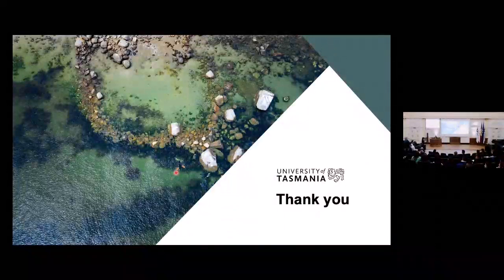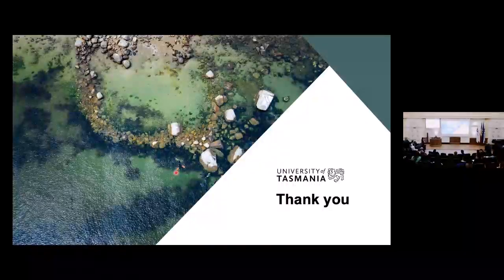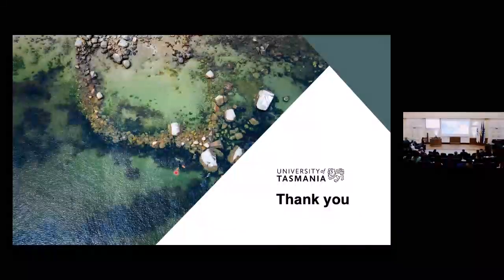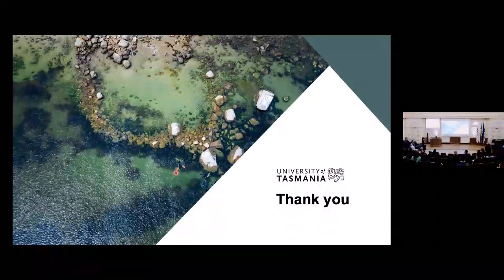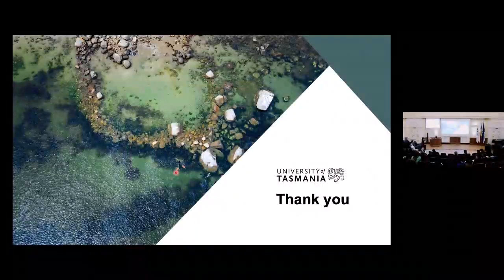Bacteria, just like humans, can change very easily. So if you feed them another medium, in terms of the volatile profiles, it will be quite different. For example, if I were to feed them spaghetti, the volatile profiles will be quite different from what I'm seeing in milk. So at the end of the day, we will need to put in a lot of work in terms of doing the screening in terms of controls. However, if we are able to get all this preliminary work done first, after that it could just be smooth sailing.